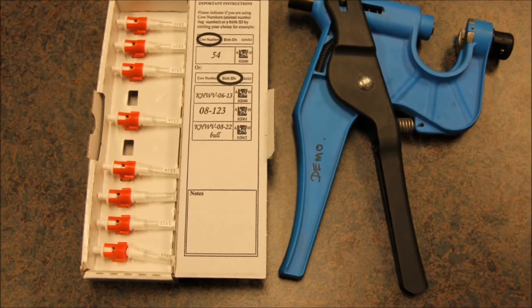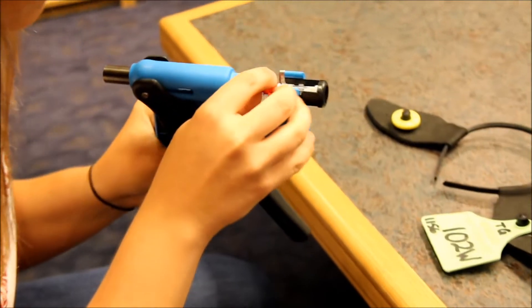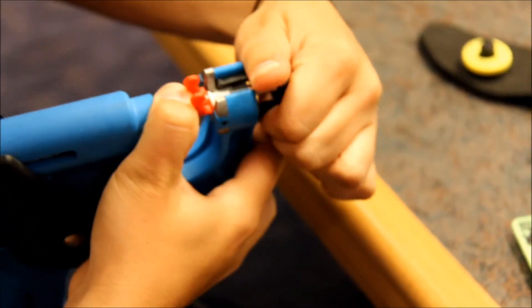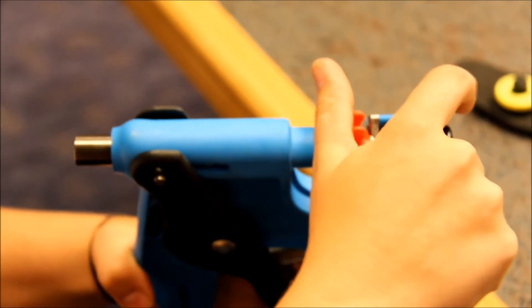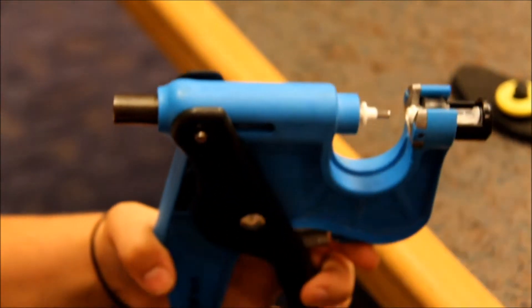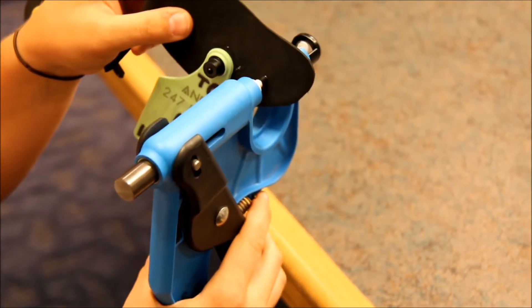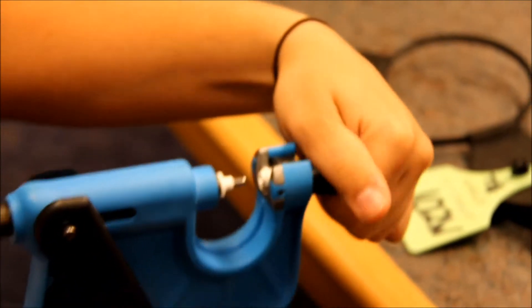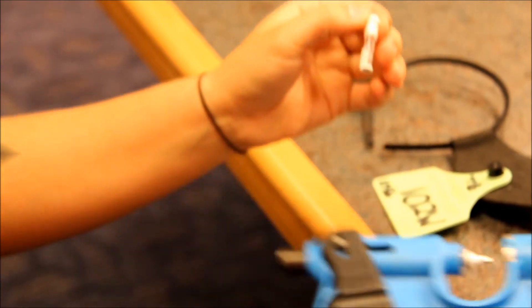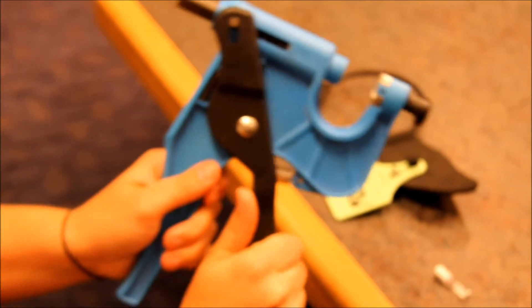Next we'll talk about the tissue tagger. The tissue tagger is simple to use — you put the vial in the tagger, lock it in, and then click the handle just enough that the white bit grabs and you're able to remove the red piece. Next, you're going to take the tissue tagger, put the animal's ear in between, and give it a good click. You will see that you've got a piece of tissue from the animal's ear. The tissue tagger is very fast and efficient, especially if you're doing a lot of animals. To eject the white bit, you just pull up on the handle a little bit and it'll pop right out.